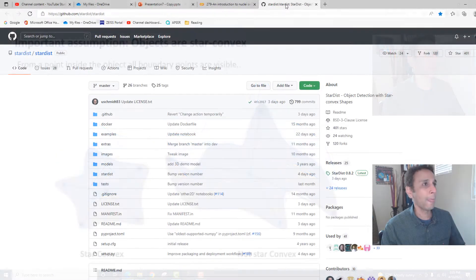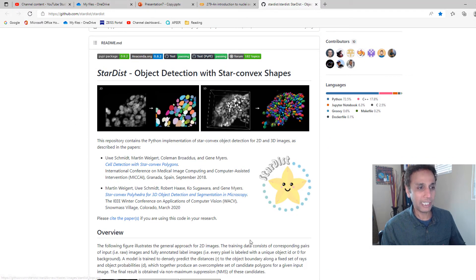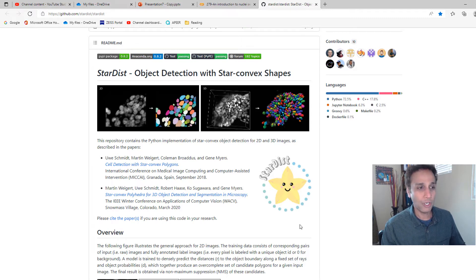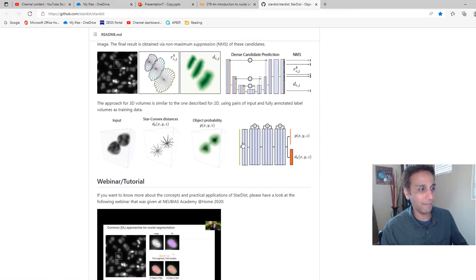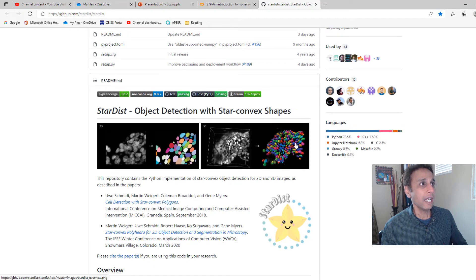As long as you have rounded or convex-like shapes, this works great regardless of your application. If you're trying to segment satellite images for roads or streets, don't use this — look at UNet. But if you're segmenting rounded objects like cells, birds, or clouds, proceed. The GitHub repository is 'stardist' — d-i-s-t, not 'dust' — and it explains every detail. They also have a webinar at the NEUBIAS Academy. This library supports both 2D and 3D segmentation.